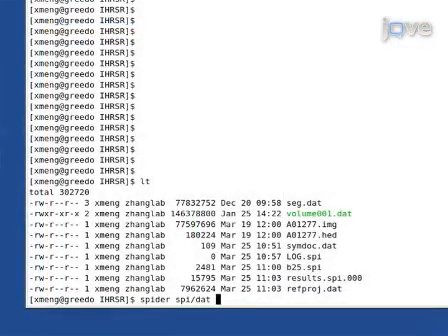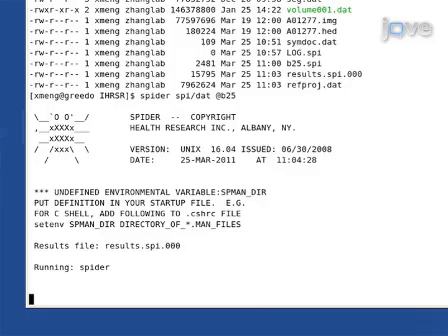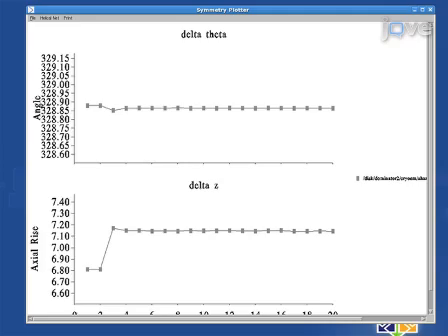no changes in the defined screw symmetry, which usually occurs after a few cycles. A right helical symmetry should give a stably converged reconstruction. The reconstruction generated in the last cycle will be used as an initial reference for further refinement.